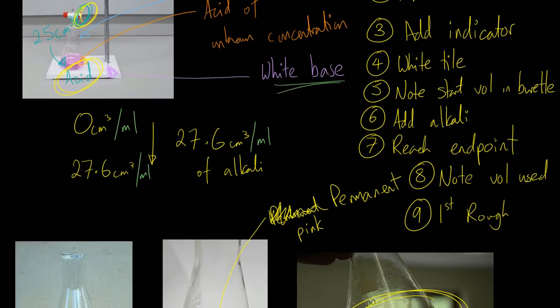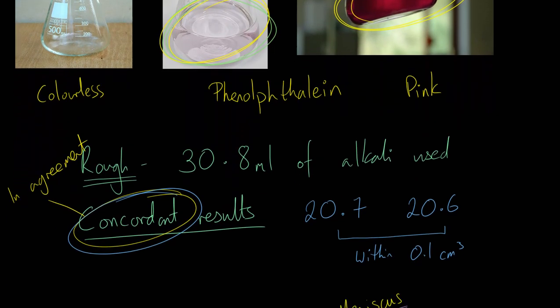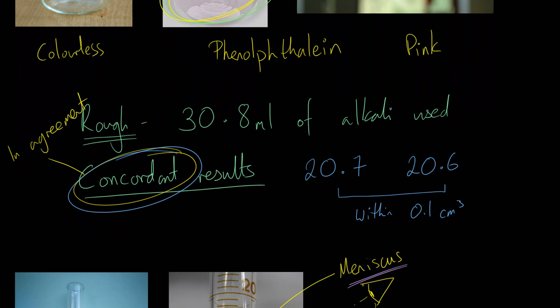Your first one is going to be very rough. Subsequent ones following that, you're going to be a lot slower and a lot more careful, and you are going to keep going until you get some concordant results.